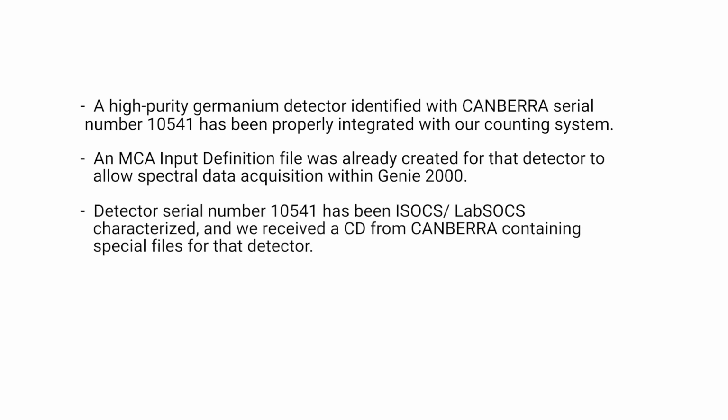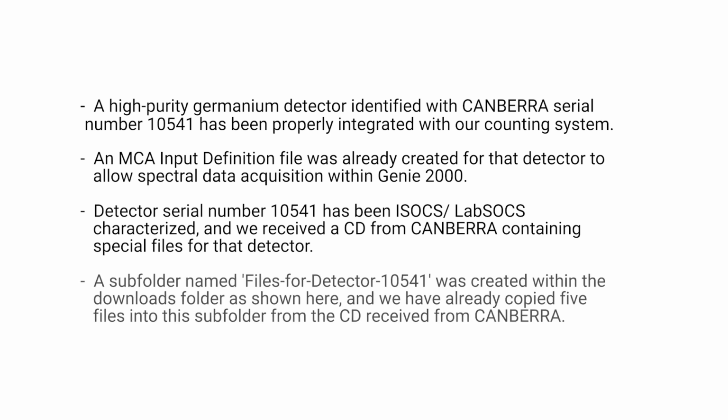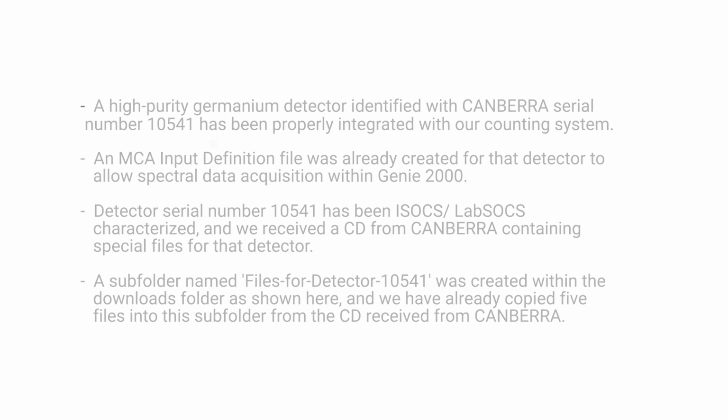Detector serial number 10541 has been ISOCS LabSOCS characterized, and we received a CD from Canberra containing special files for that detector. A subfolder named Files for Detector 10541 was created within the Downloads folder as shown here, and we have already copied 5 files into the subfolder from the CD received from Canberra.